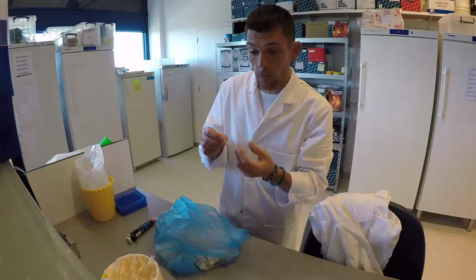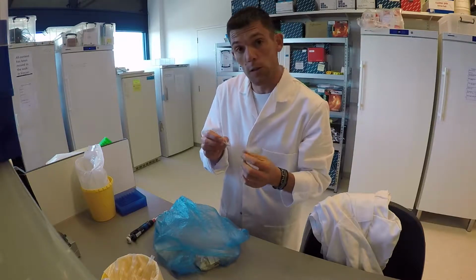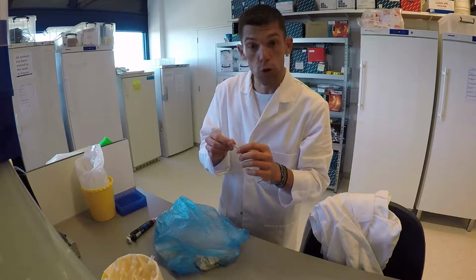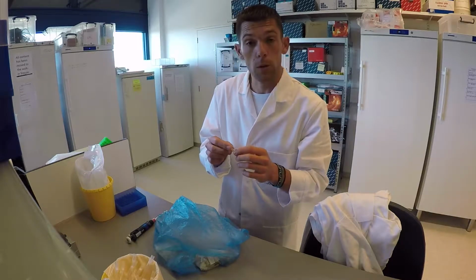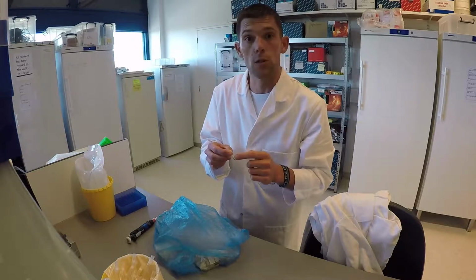and because we froze them, the DNA, the genetic material of the fungi that are in these roots is still intact, and we will use that genetic material to identify exactly which fungi are living inside each of these plant roots. It will take us a few more weeks before we'll get the results from our samples.